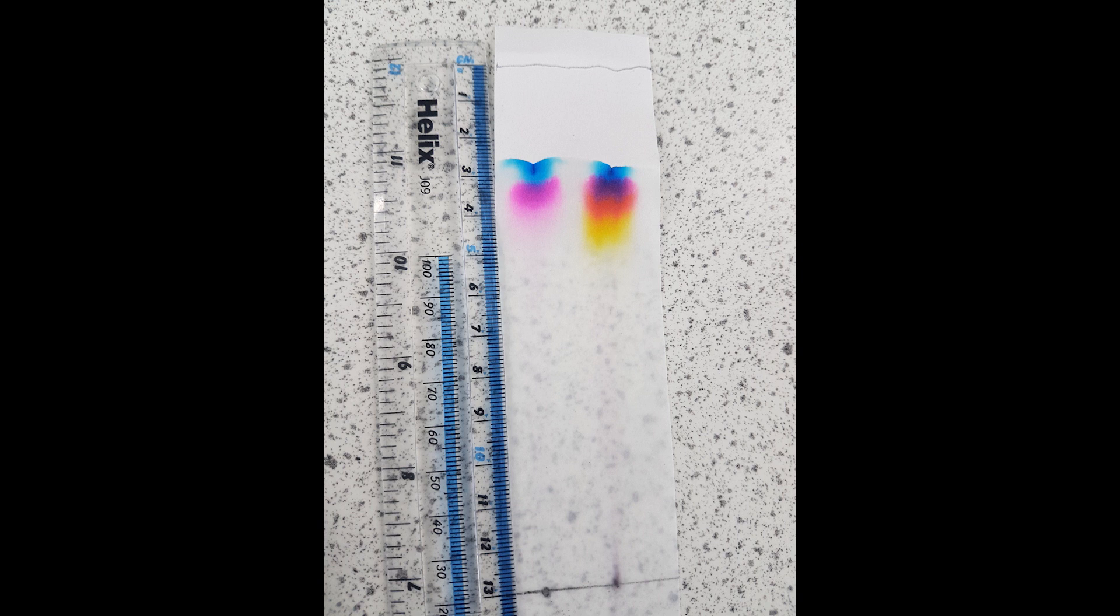I can do the same thing for every other color that I see on the chromatography paper. And that is how you calculate your RF value. So that's again, in this particular pink case, it was nine and a half centimeters divided by 13 centimeters, and that will give you your RF value.